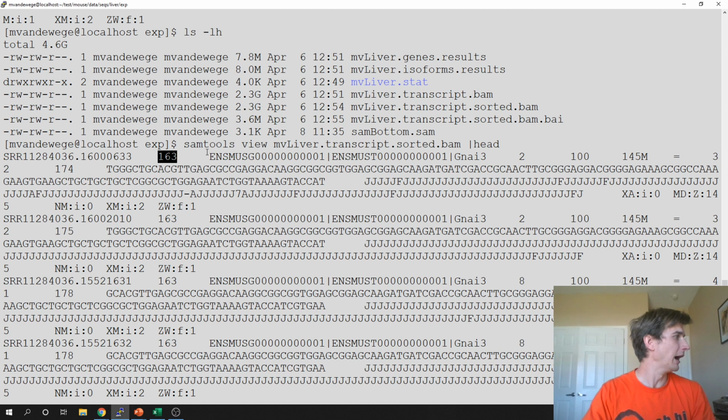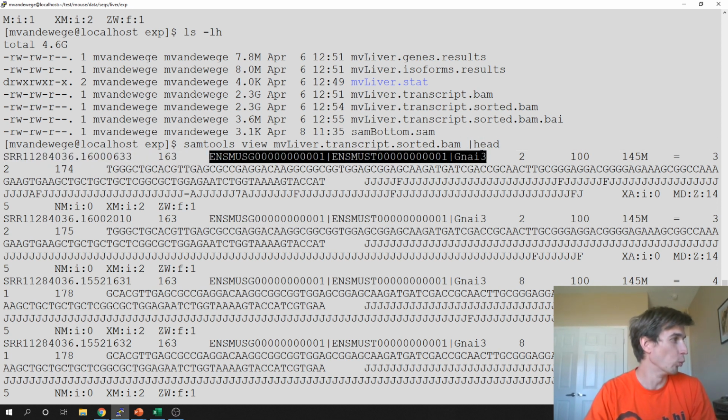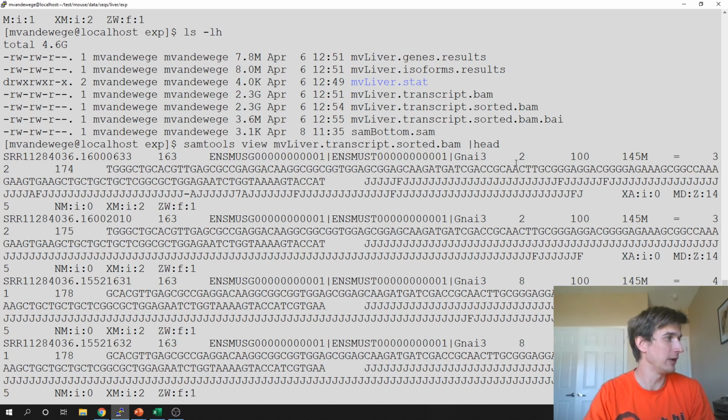Then it tells us, in this specific instance, which gene it mapped to, which position in this gene it mapped to, a score. This is a map score of how well this read mapped. It's also kind of a uniqueness score of measuring how many places this could have mapped in a genome or in our reference.